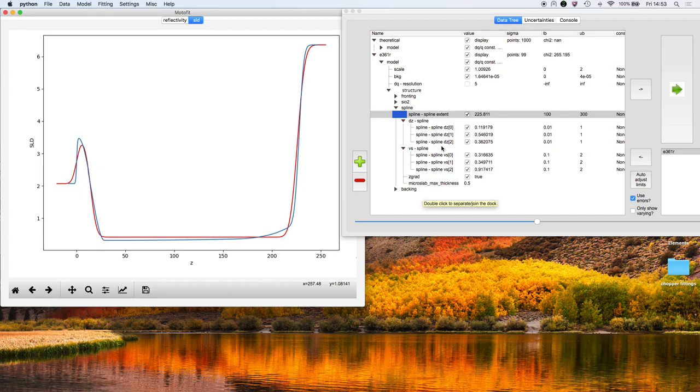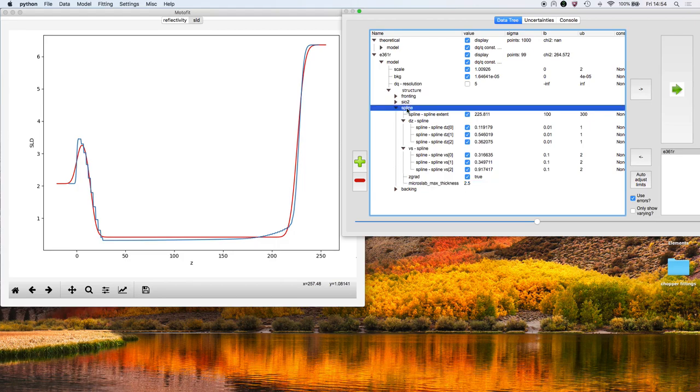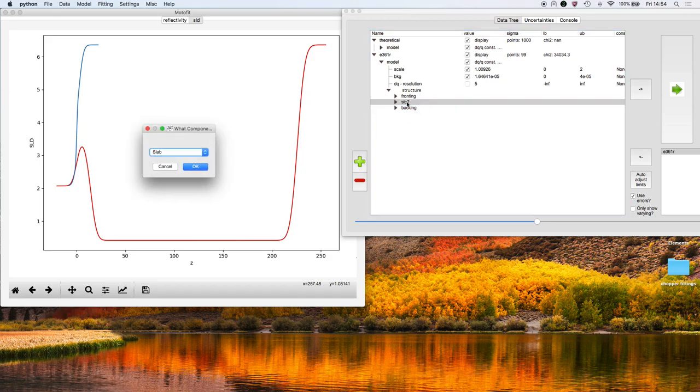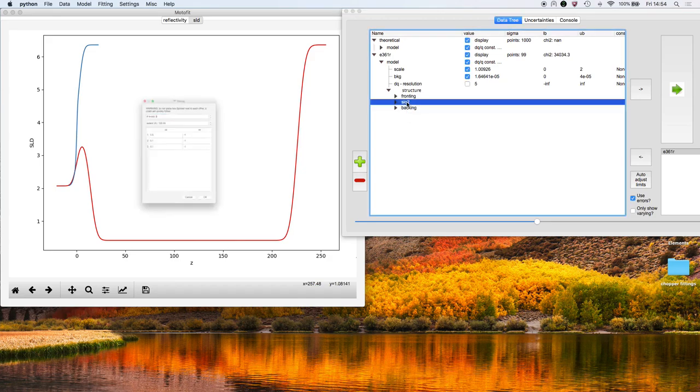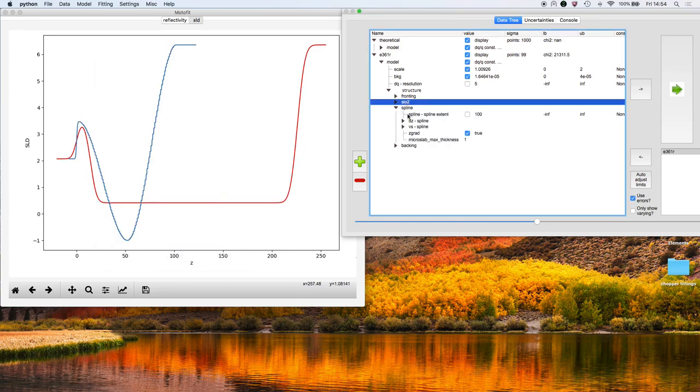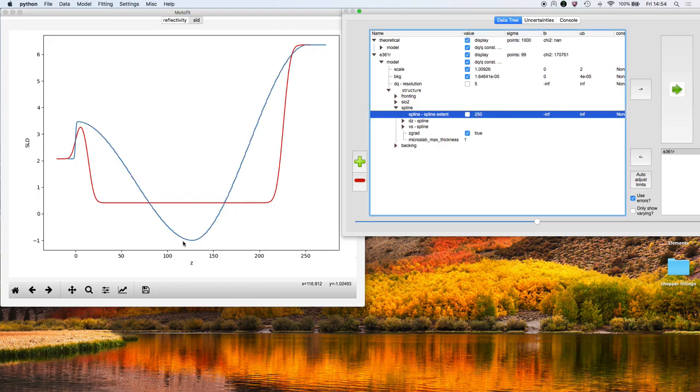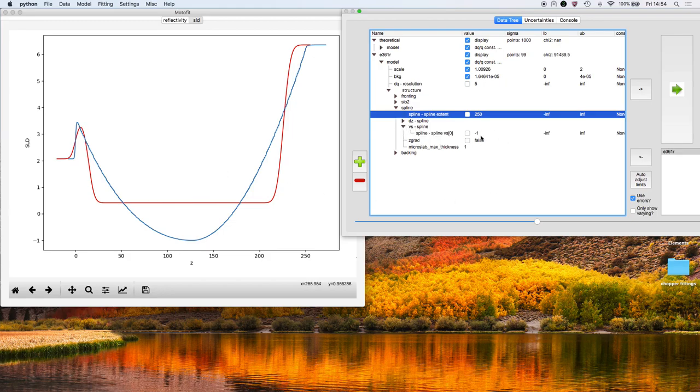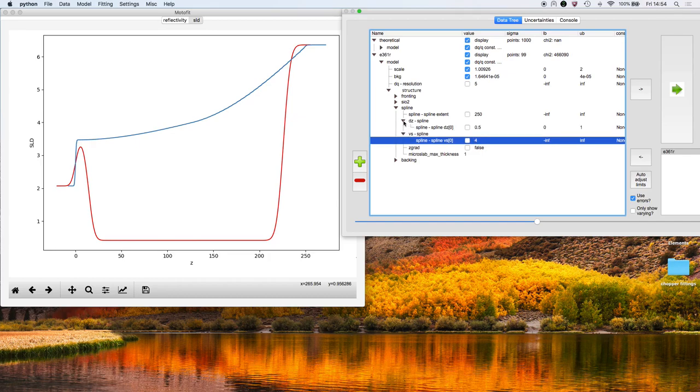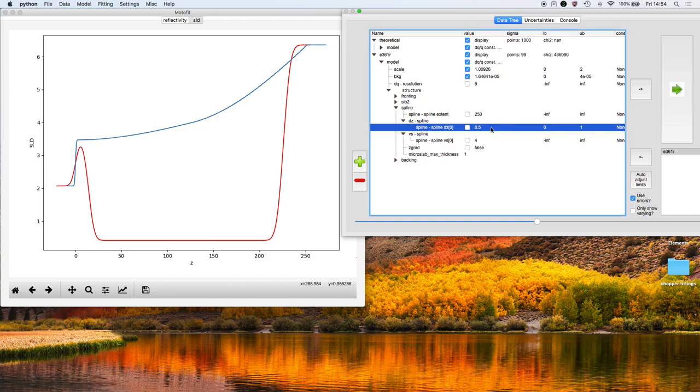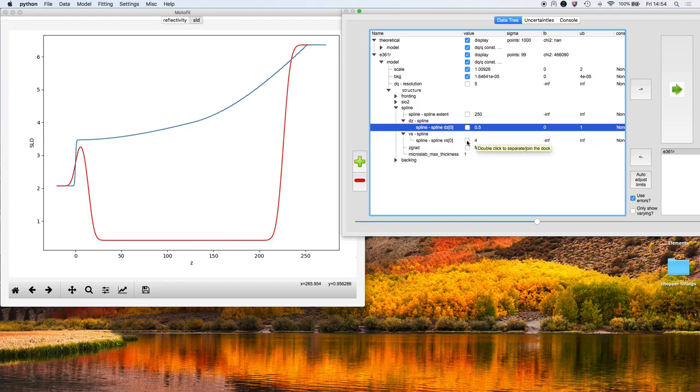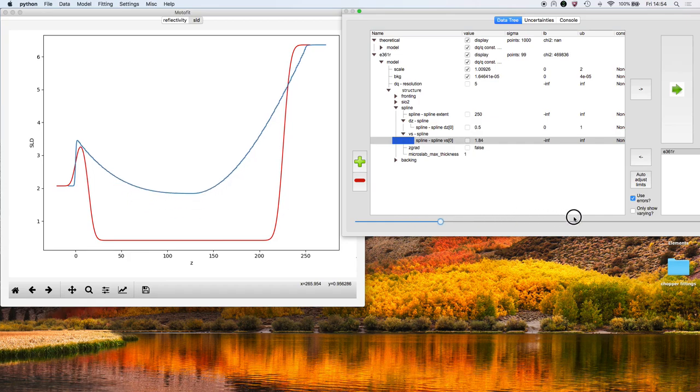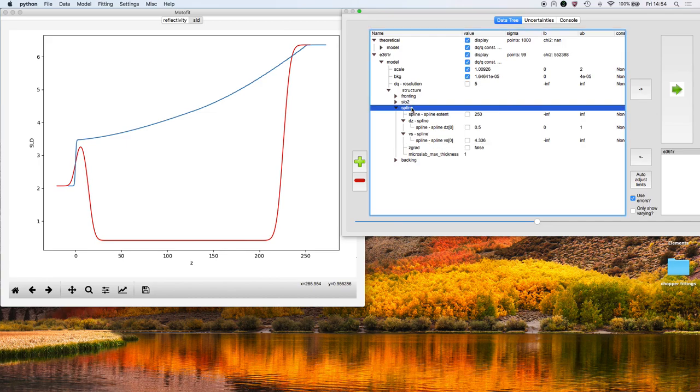It is a worthwhile exercise showing you how useful a spline is. I might just get rid of that spline component now and add in a spline with just one knot. That will be the spline control point down there. You can see the effect of turning off zero gradient at both ends. 0.5 means that the knot is half the way through that 250 angstrom extent of the spline. We're just using it to generate smoothly varying curves.